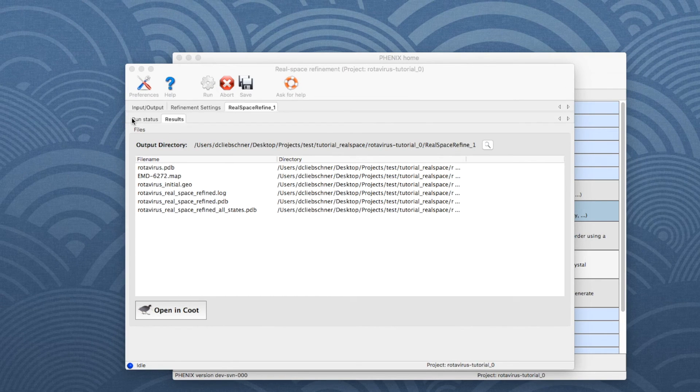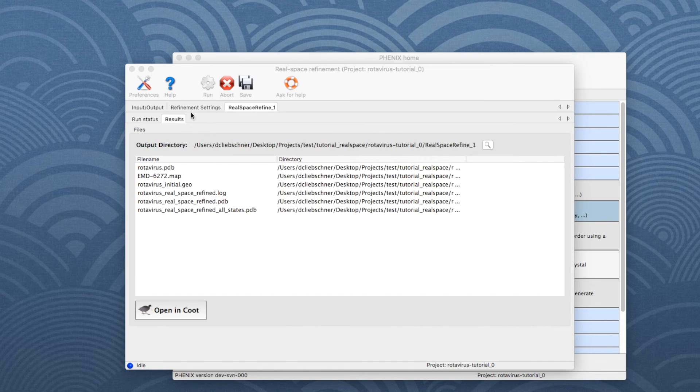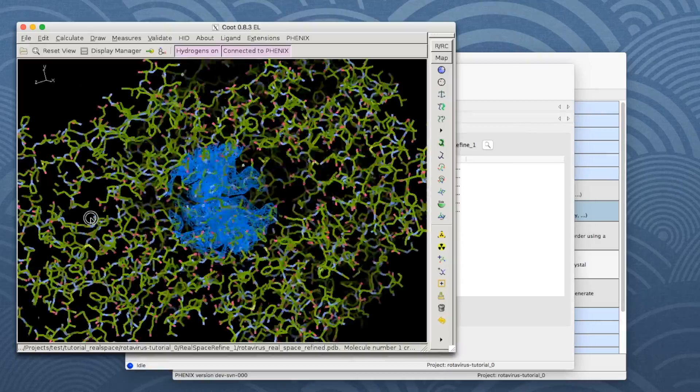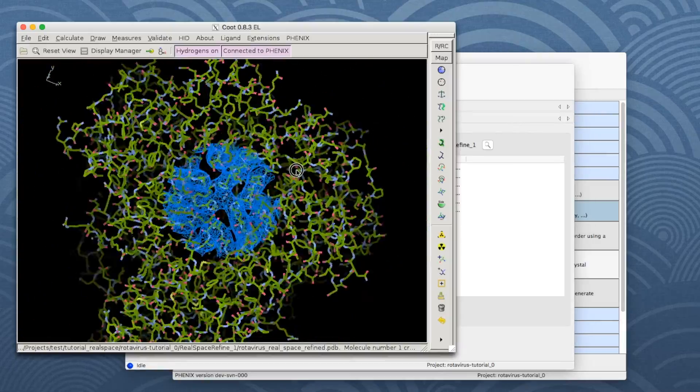When refinement is finished, a new tab appears, which contains a list of the output files. Click Open in Coot to see the map and the final model.